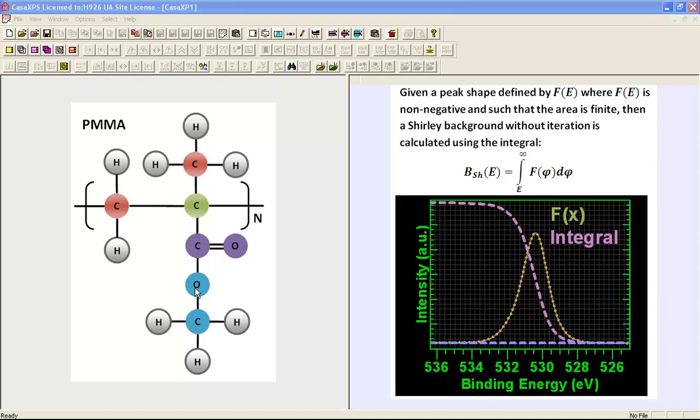And we also have oxygen 1s, and there are only 2 peaks, so we should see 2 equally sized peaks, and these are chemically shifted so that we can actually see these peaks, but not too shifted, so we have a relatively narrow interval over which the oxygen 1s is located. This means that we can see the background, and the background that is associated with the carbon 1s is slightly more involved because the changes in the background may occur at some point beneath these carbon peaks.